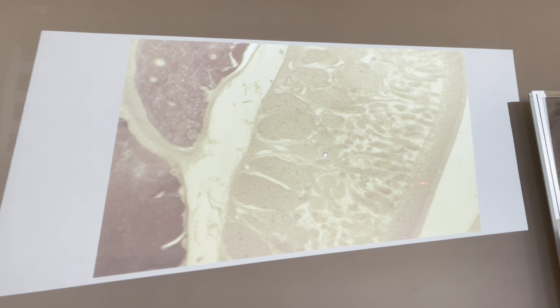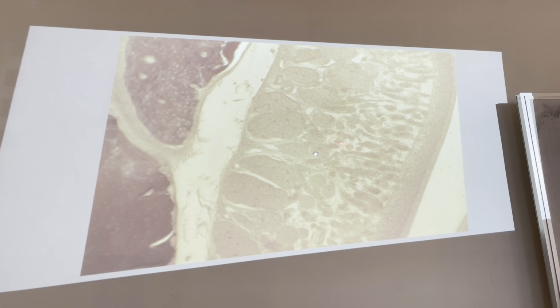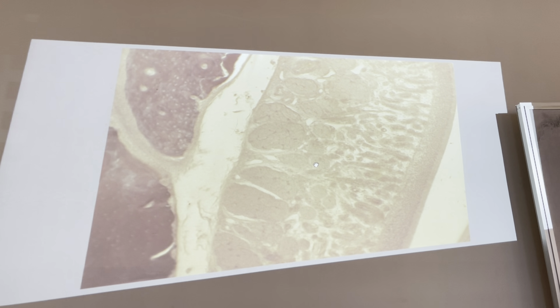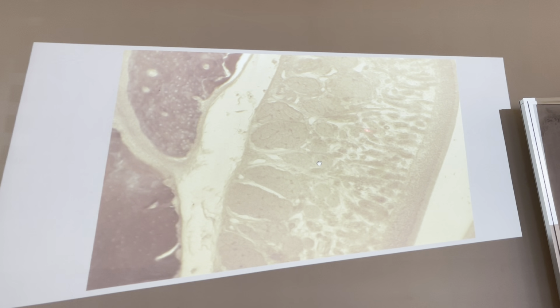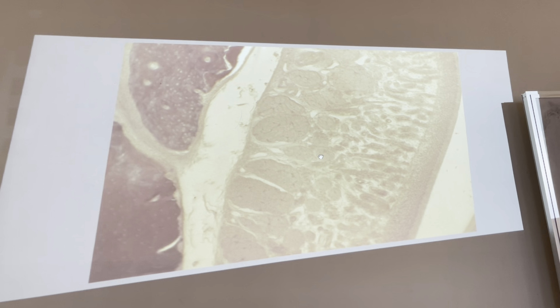About the lamina propria, from this to here, all of this is the lamina propria. What do we have? Take a look. This is the secretory portion of some glands, which we call Bowman's glands, or from the name, olfactory glands. They are serous in nature, flushing the apical surface of the olfactory epithelium to prepare it for the next odor.